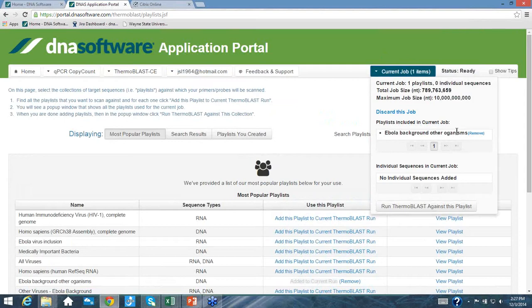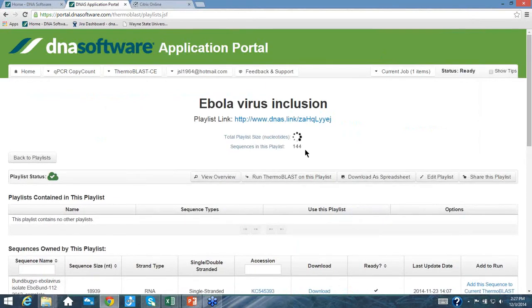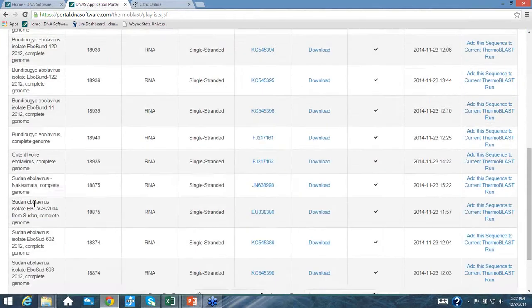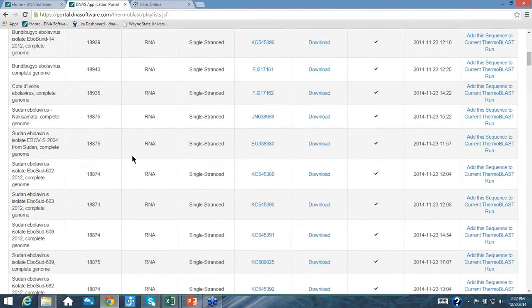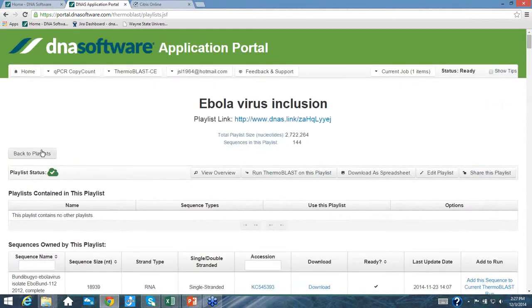All right, so with that, we'd be ready to run it. If you're interested in knowing what's in there, you can click on the View playlist down here. If you do that, it takes us out of that window briefly and shows us what's in there. 144 sequences in that playlist, and here they are. Okay, so it's got a whole bunch of variants of Sudan and Zaire and lots and lots of. You can view all of them if you want here. So you can see there's, you know, Côte d'Ivoire and Reston and all the different variants of Ebola. It's 2.7 million nucleotides.